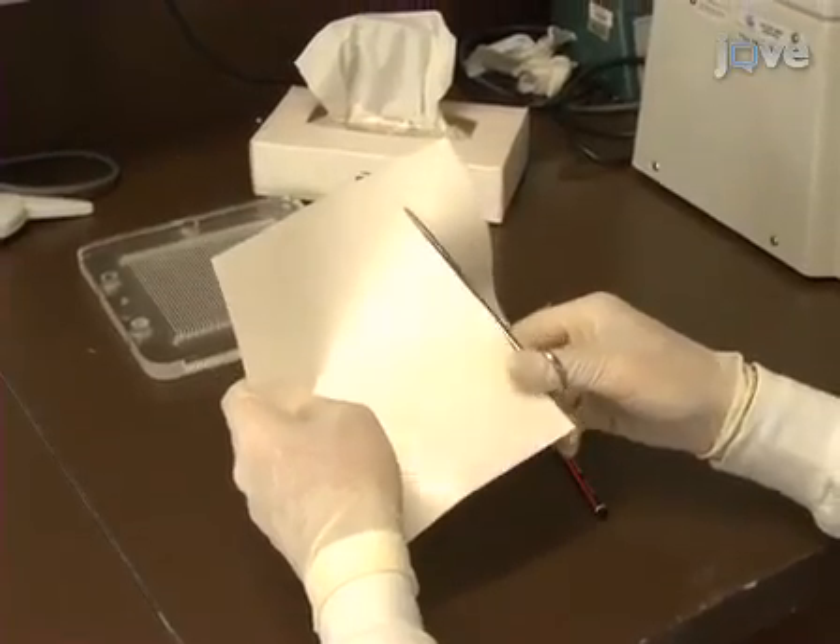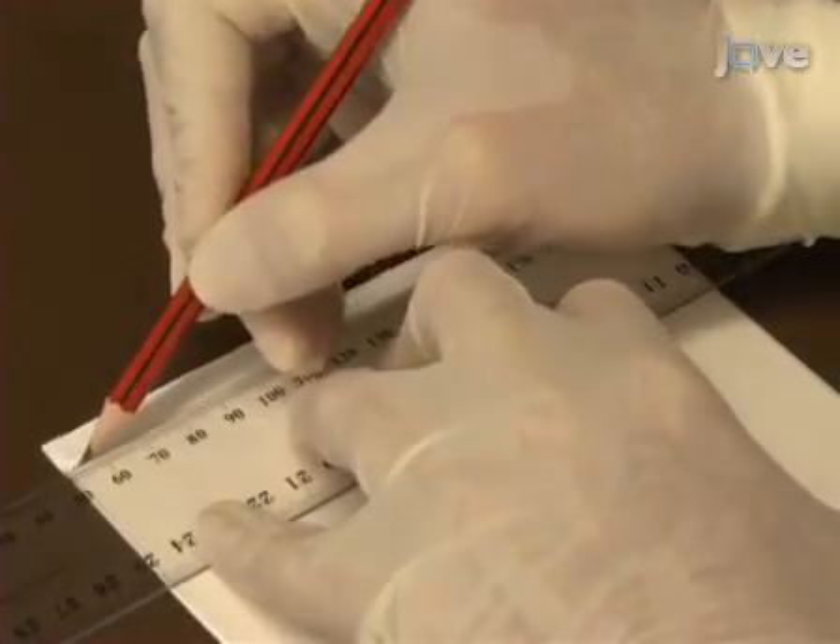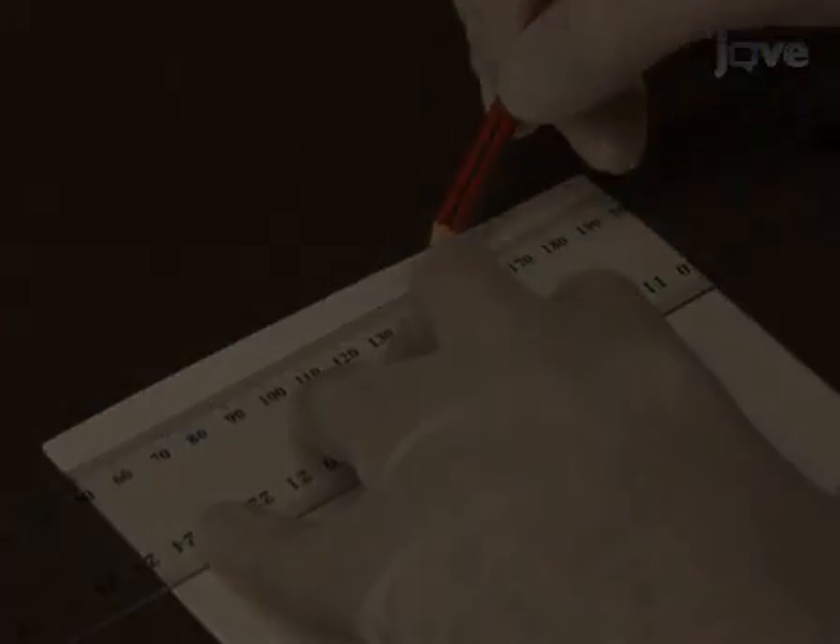Cut the nylon membrane to 15 by 15 centimetres. Using a pencil and ruler, mark off a 0.5 centimetre space across the top of the membrane.